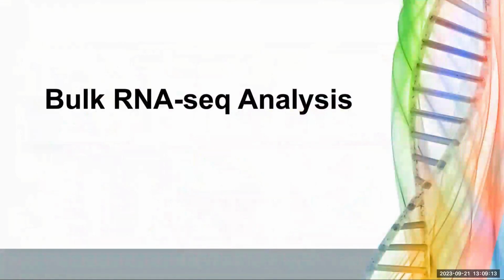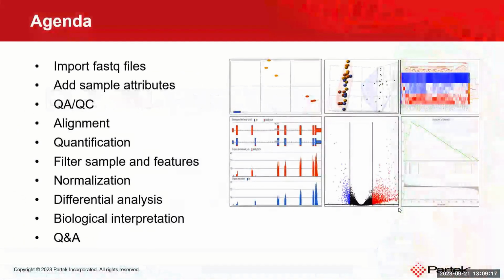So today we're going to focus on bulk RNA-seq data analysis. I will show you a typical analysis pipeline for bulk RNA-seq in Partek Flow. We will start to import FASTQ files and add sample metadata.